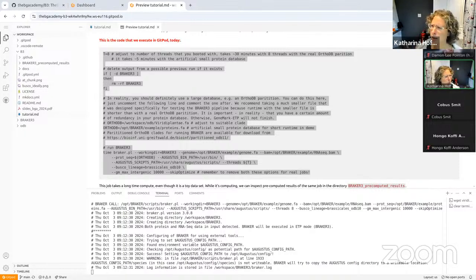There's a bit of a tricky thing if you are not an experienced Singularity user. If you originally built the latest image, you may have to specify a version tag, because if it already has latest, it will not know that latest is now something else. But we put effort into tagging properly. So now it's like v3.0, something. You can rebuild those containers, and Docker and Singularity are the same, and the license key is not required anymore.